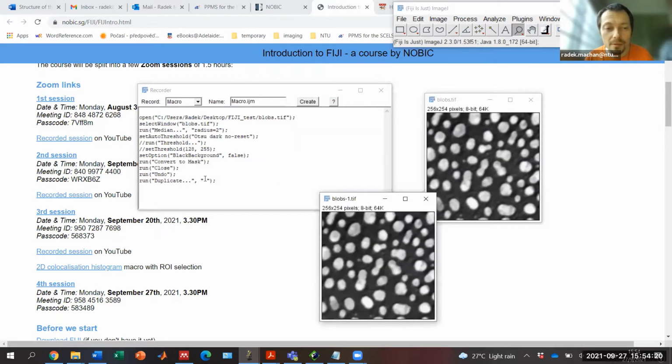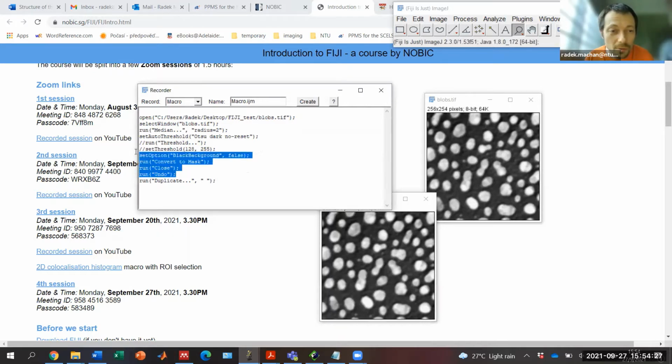And then I will delete this, not to confuse us.